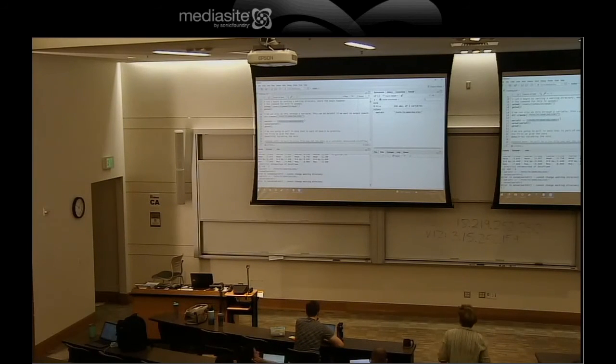Change the top of your script and rerun those lines if you did not change it before.